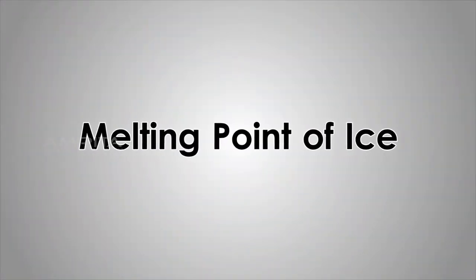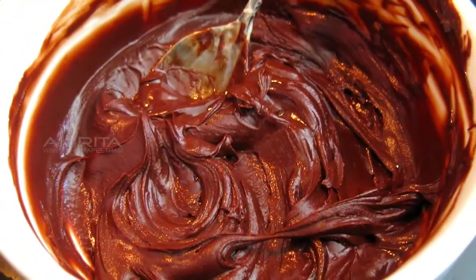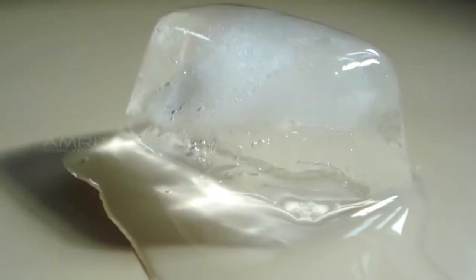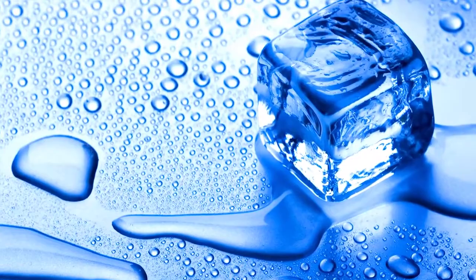Melting point of ice. The constant temperature at which a solid changes to a liquid is called the melting point of the solid. At the melting point, the solid and liquid phases exist in equilibrium.